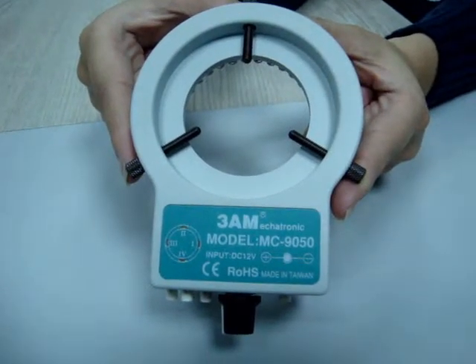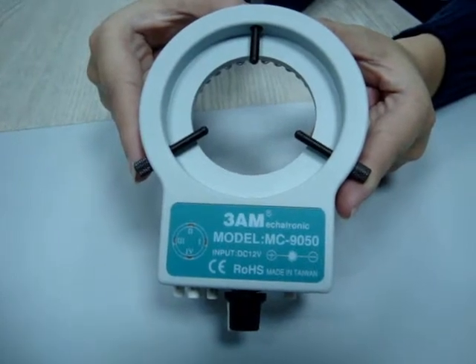This is a coloring light for microscopes. It is small but it is easy to use.